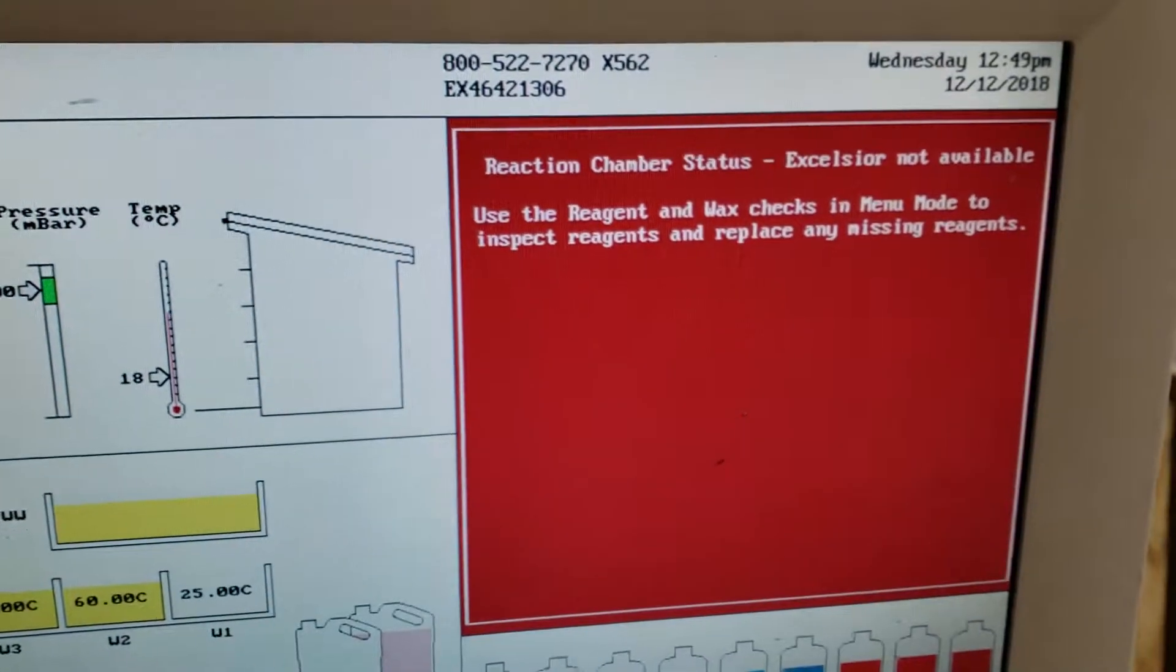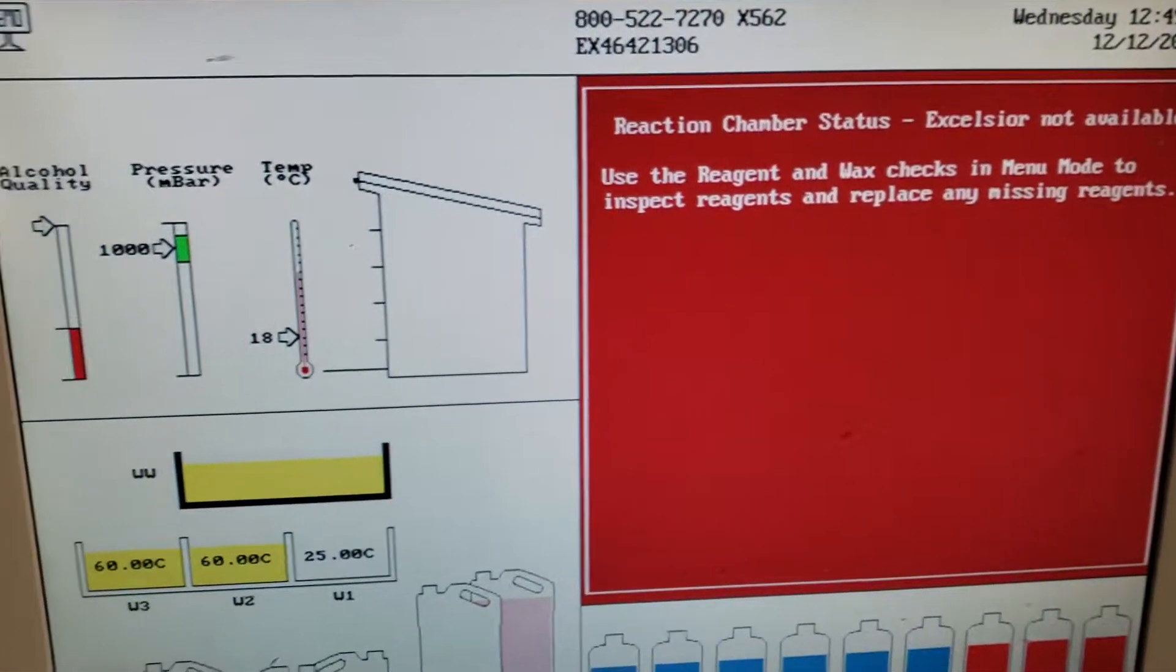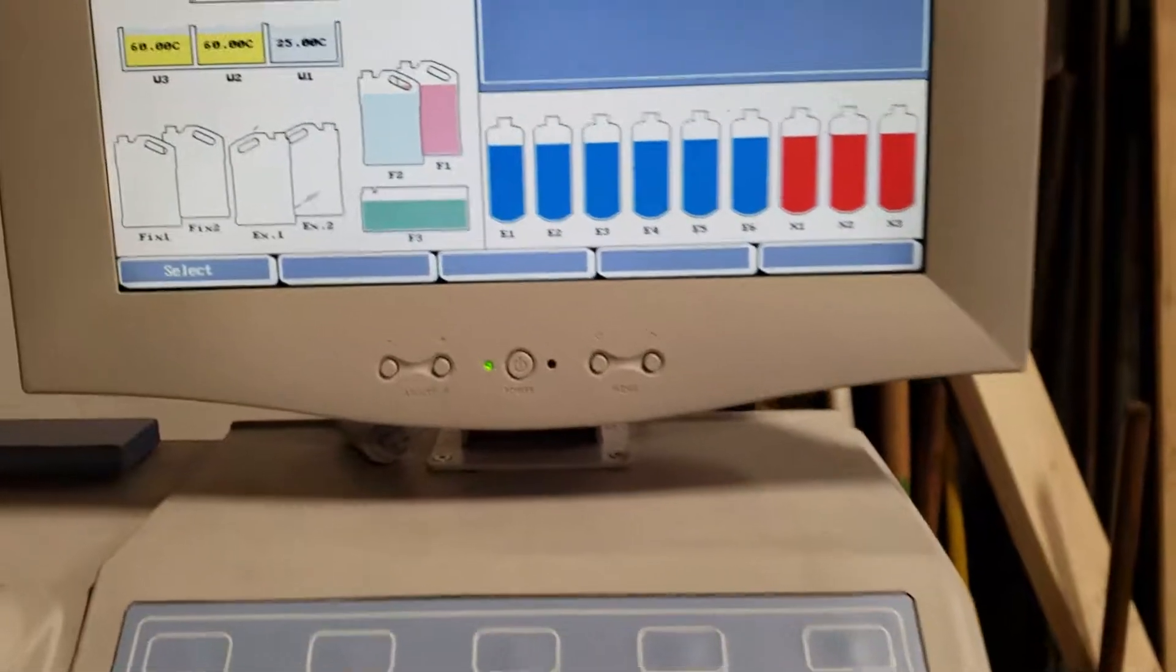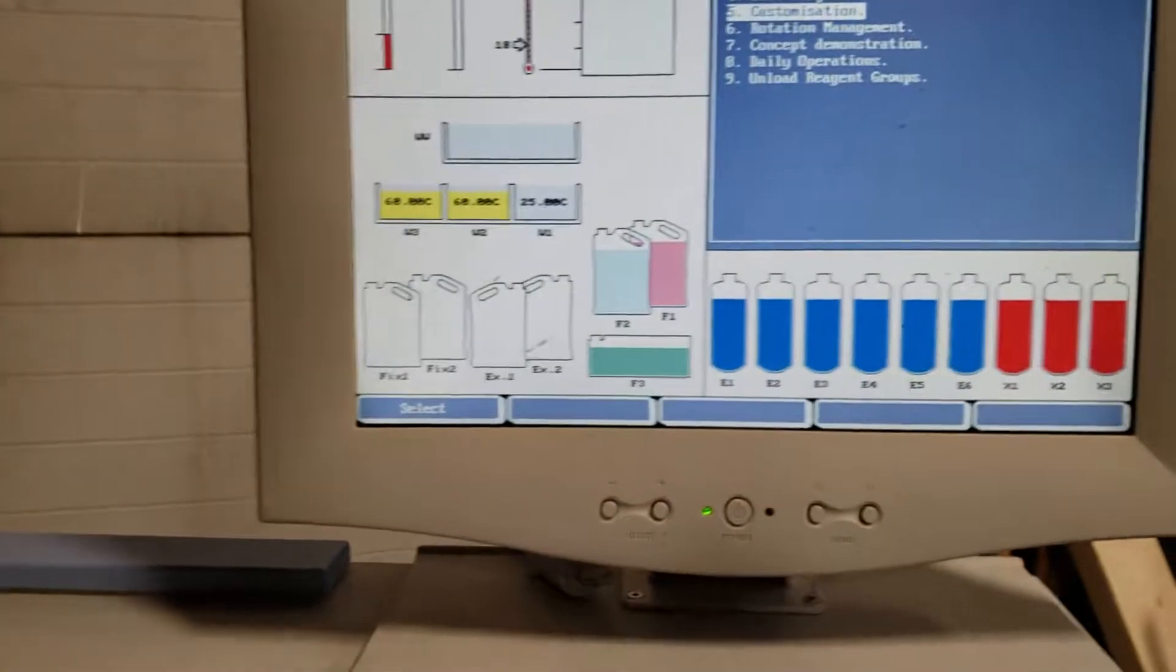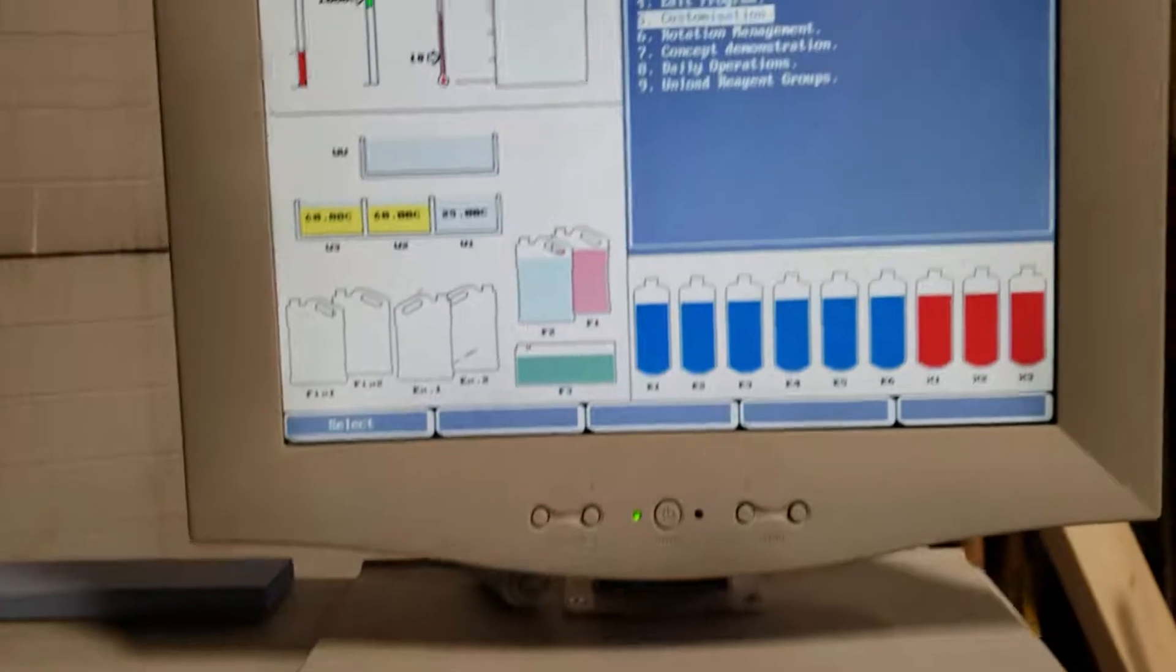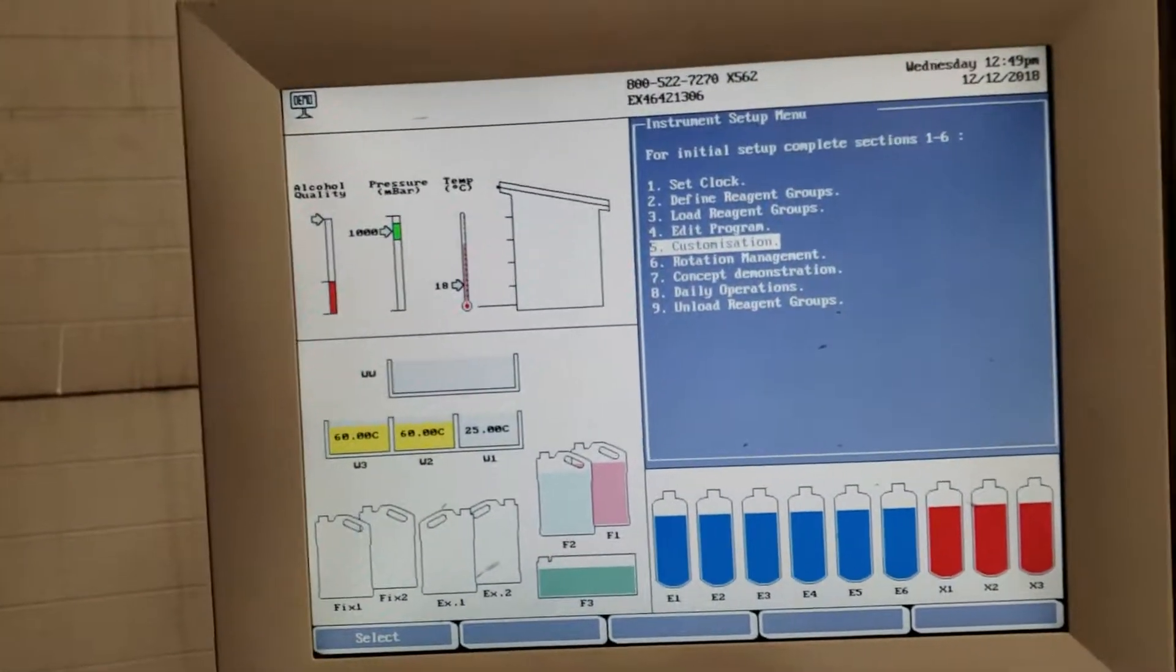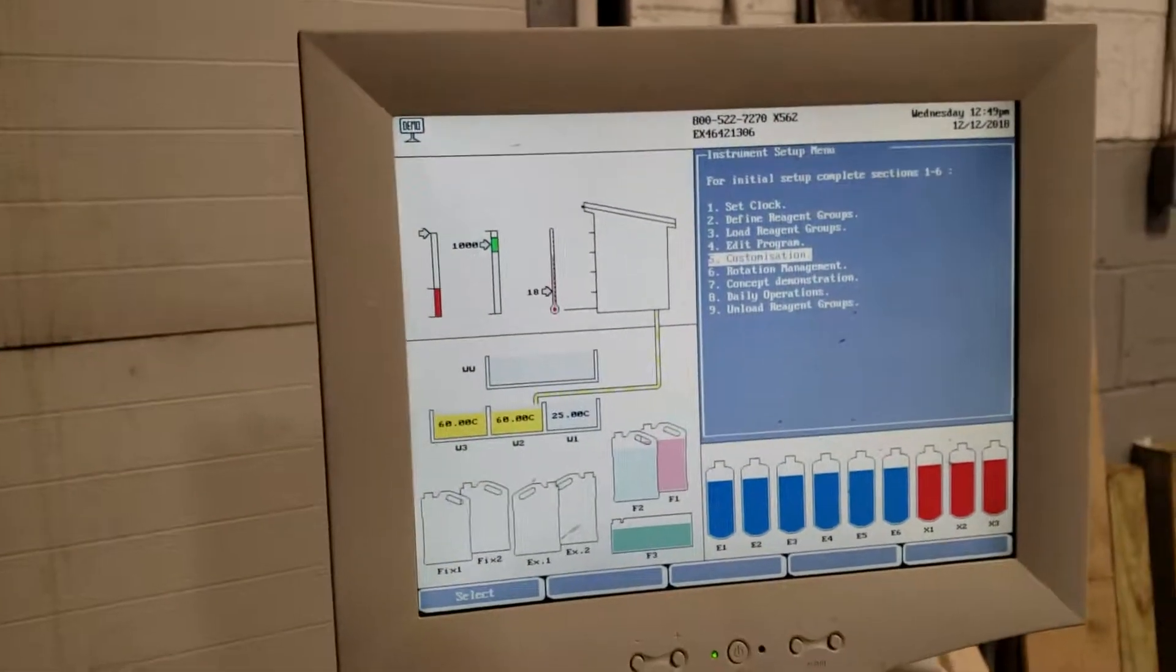It's interesting when you do that - it pops this display on. I thought one of the doors would trigger it too, but that's it.